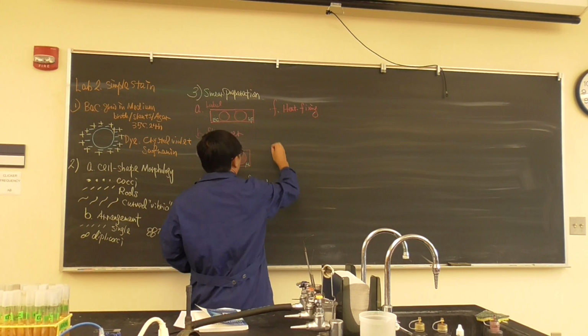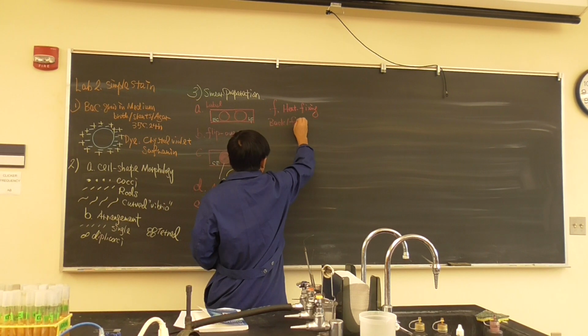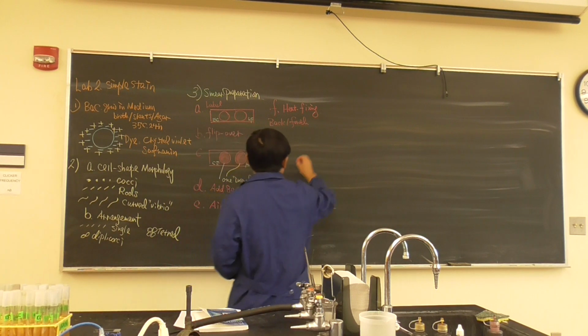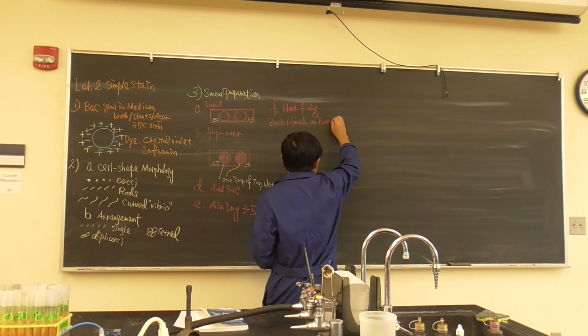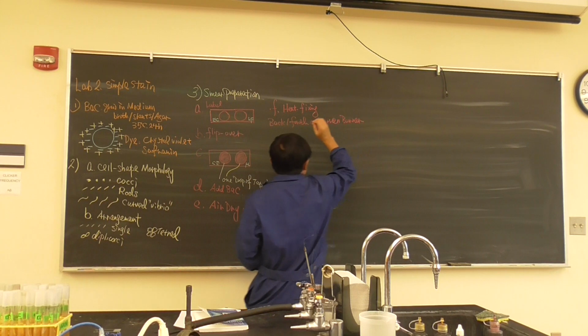Heat fixing, usually what we do is move it back and forth on the Bunsen burner a couple of times.